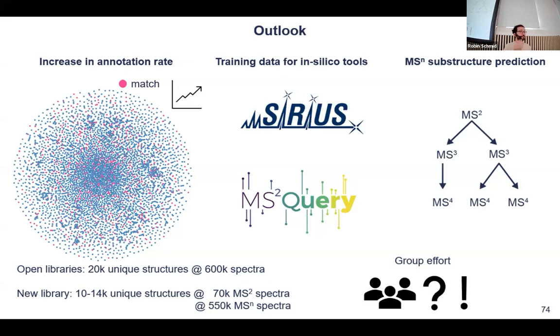I know that for SIRIUS, for example, they don't really look at the intensities. They very much say we need as much information as we can get. So more signals is more important than having exactly the same intensities. So more signals, more information. So increasing the fragmentation energy and having multiple ones merged is maybe better.